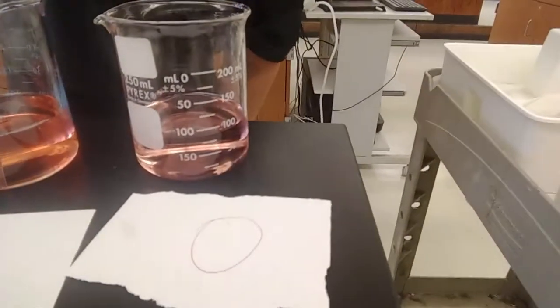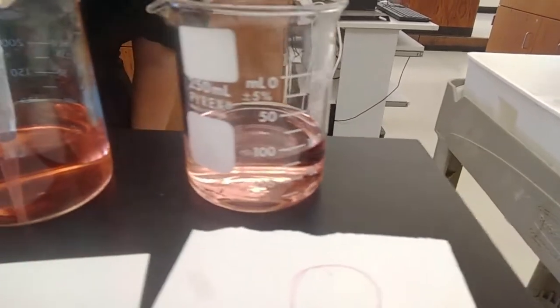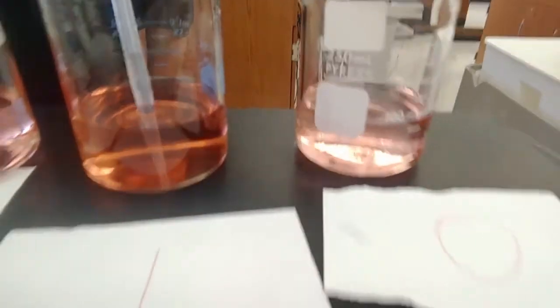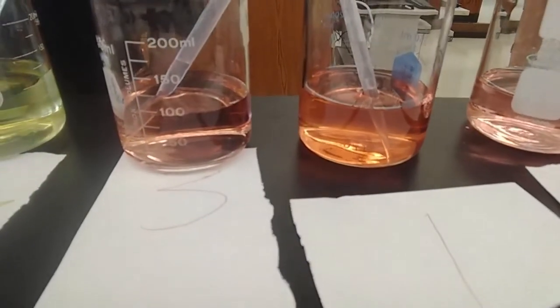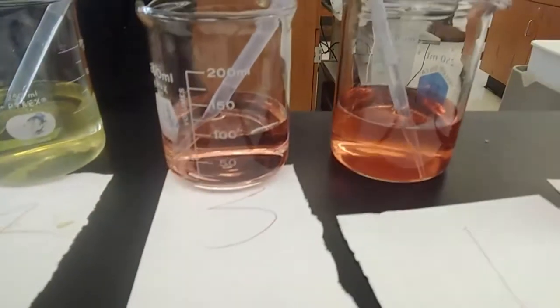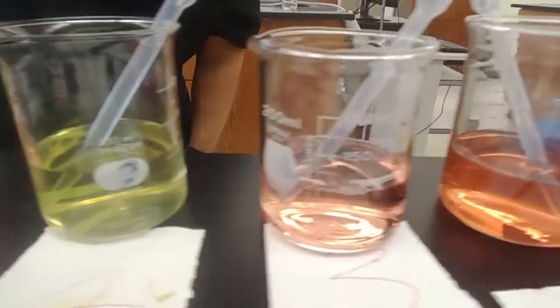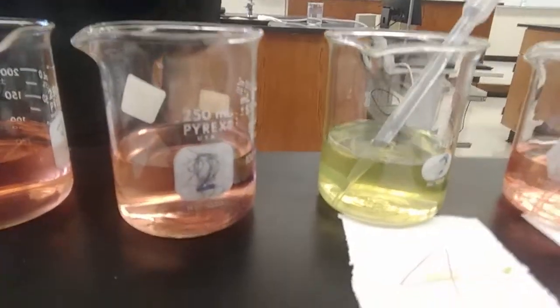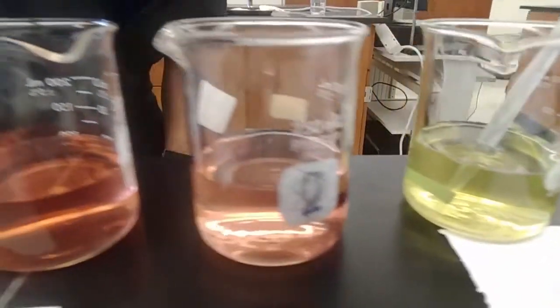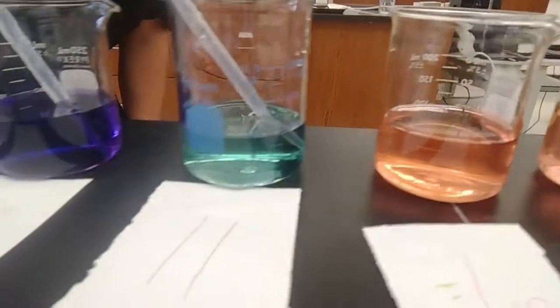For pH 0, we have this sort of light peach color. 1 is a little darker peach. 3, sort of similar to 0, peach color. 4, we're getting a little greener. 7 is not really 7, we're back to this peach. 10 is not really 10, back to the peach. 11, there we go.